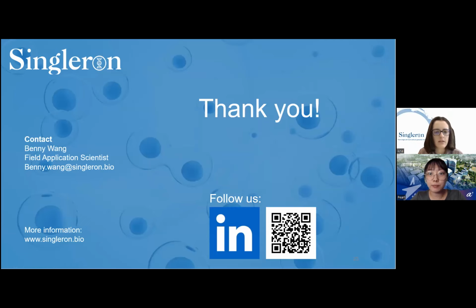Hi, may I know what batch correction method I can use with SynEcoSys? So the batch correction method is Harmony, as I mentioned before, and you can also find the reference in the documentation page.